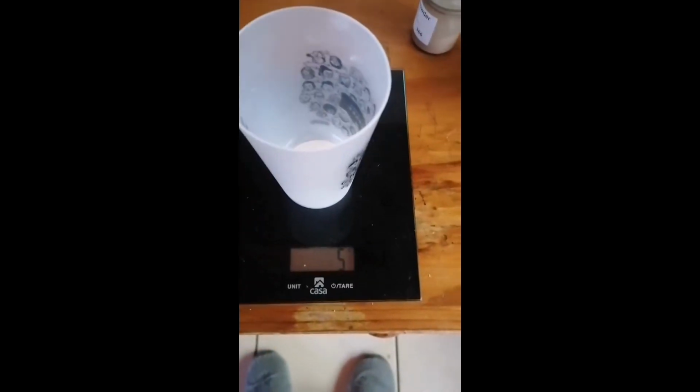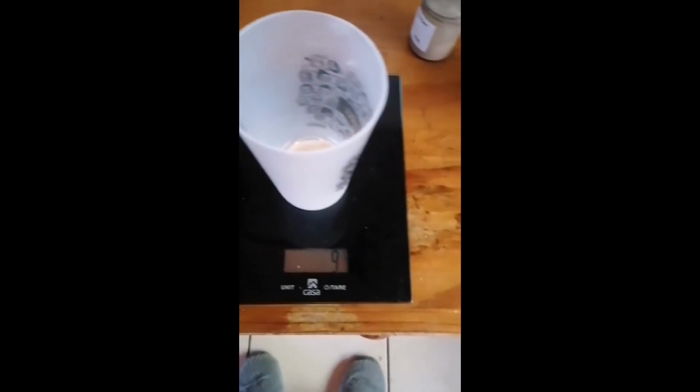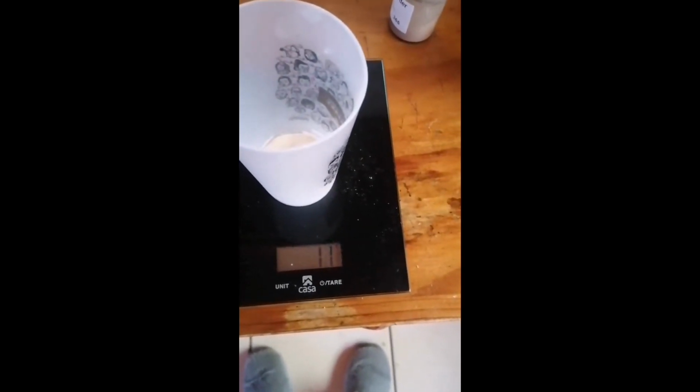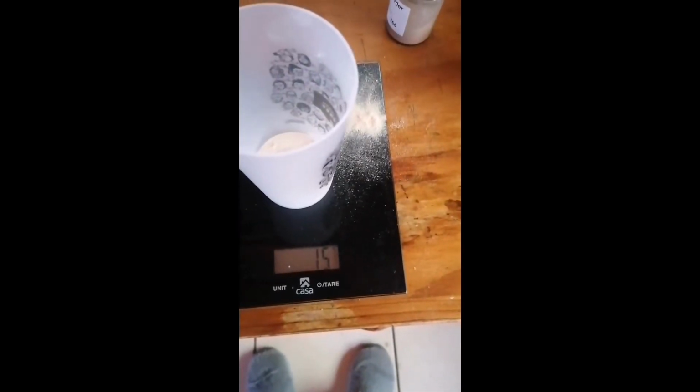And over here we are going to be adding the light malt extract, so I will be adding 10 grams. I have divided the original recipe because I don't need a liter of agar, I only need about 300 grams. Okay, so now we have that in there.